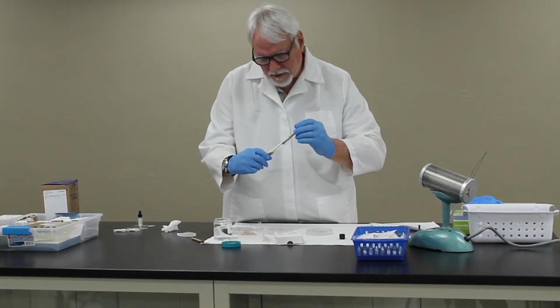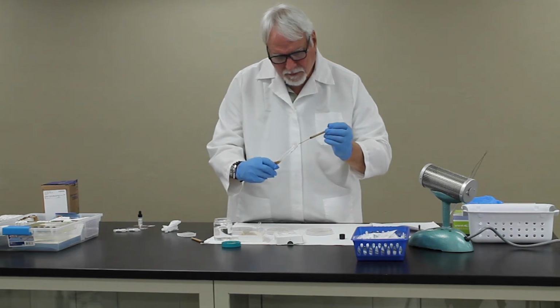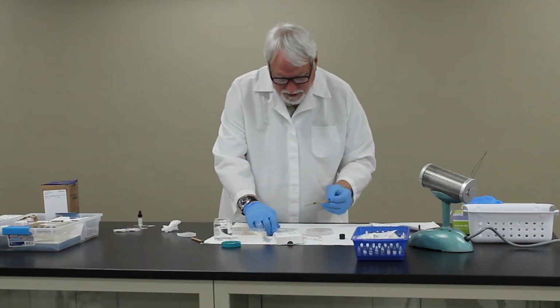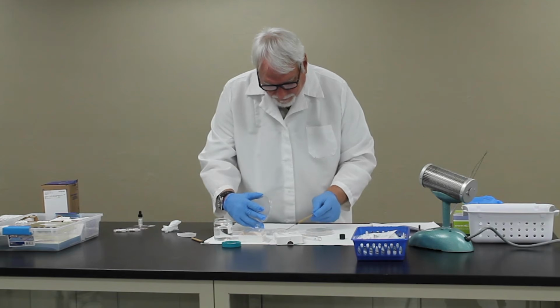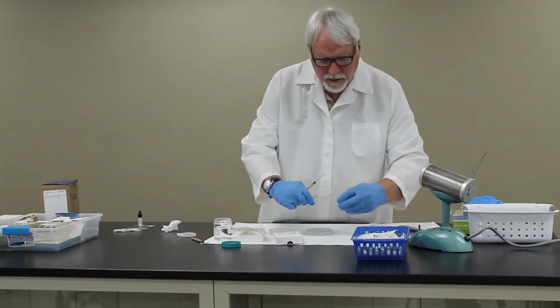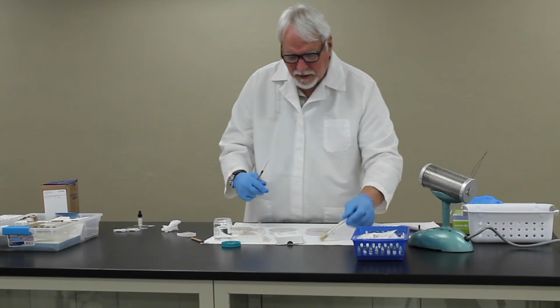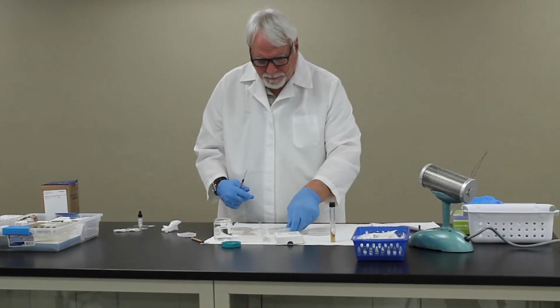Easier said than done. And then we're going to place that right in the center of the plate. So you just inoculate it into one spot, and then that mycelium is going to grow out from that area. So that's the way you inoculate any kind of plated medium with your fungi.